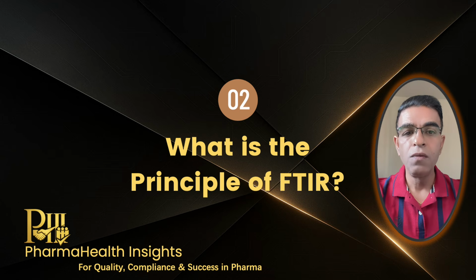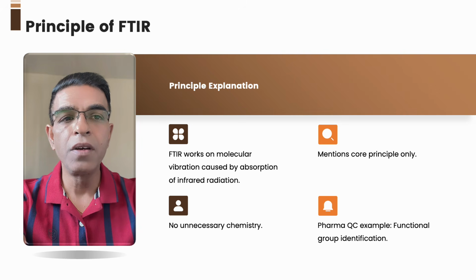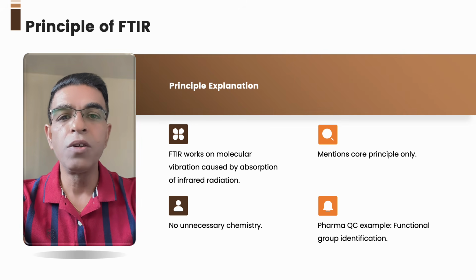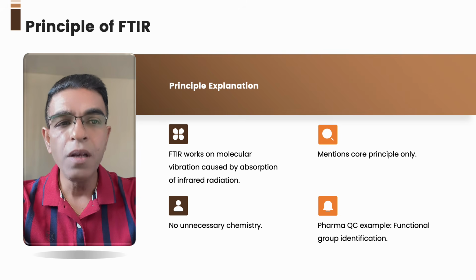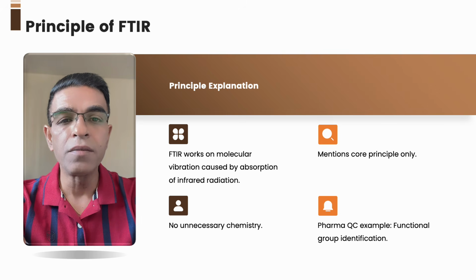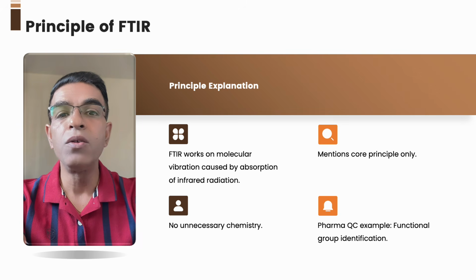So once you tell what FTIR is, the next question obviously will be, what is the principle of FTIR? Now, the interviewer may go one step deeper and ask, "Okay, what's the principle of FTIR?" And here, you don't need to give a textbook definition. Just explain it like you're talking normally. "Sir, the basic idea of FTIR is very simple. When infrared light passes through a molecule, the chemical bonds inside that molecule start reacting. Some bonds absorb that energy, and because of that, they begin to vibrate.